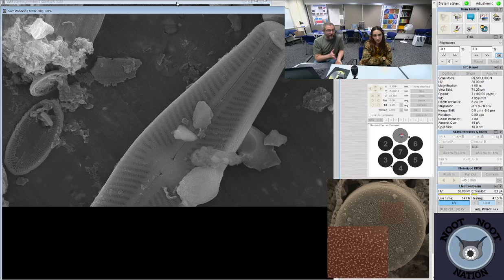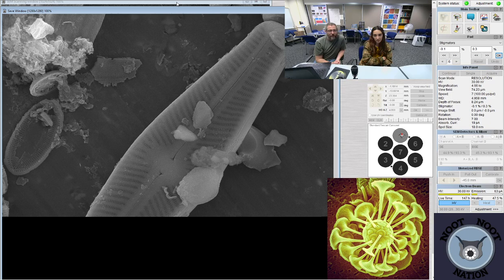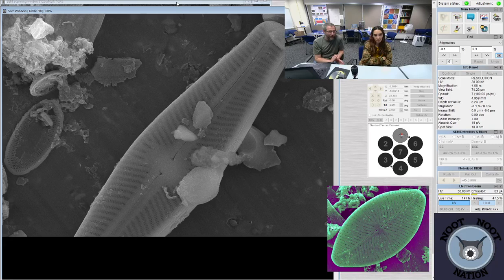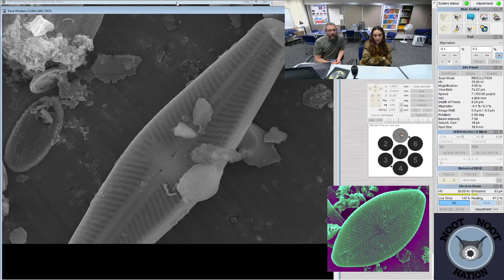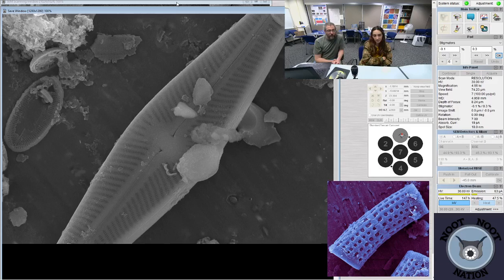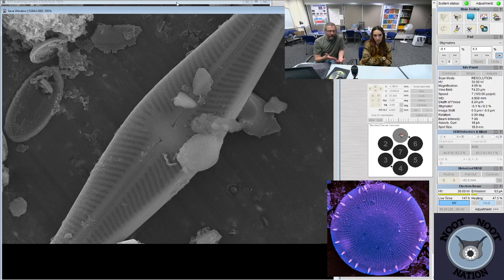I mean, that's a little bit self-fulfilling, but probably it didn't inhibit them to use silica. So that's probably why. I don't know. I'm not sure about the true why, but structurally speaking, for their size and the lightness of the skeletons in terms of the density, they're pretty strong.